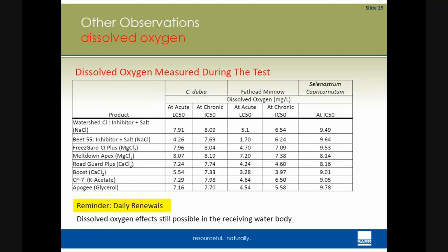And there still may be some dissolved oxygen effects in the receiving water body, and that may be a contributor to toxicity. But in this study, because we had daily renewals of the test solution, it did not really come into play. Any questions about this conclusion?